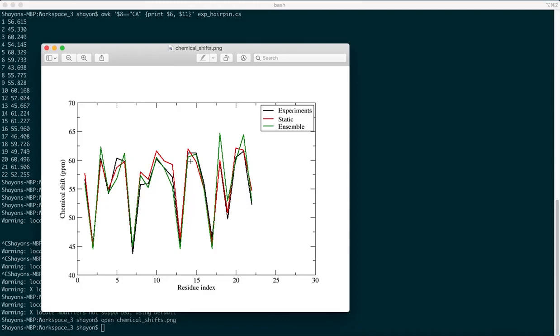So you can employ other statistical methods like regression analysis and correlation coefficients in order to find the degree of fit of the predicted chemical shift values with that of the experimentally assigned chemical shift values. Okay, so SHIFTX2 is a very efficient program in that regard to predict the chemical shift from a PDB structure, in this case the beta hairpin of alpha-synuclein bound to an Affibody.